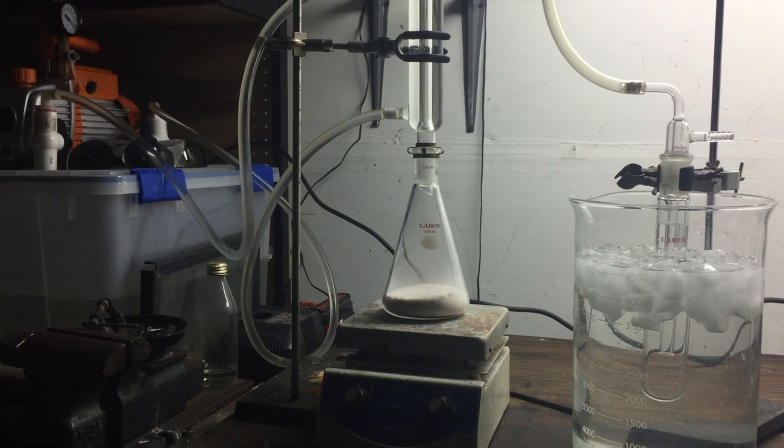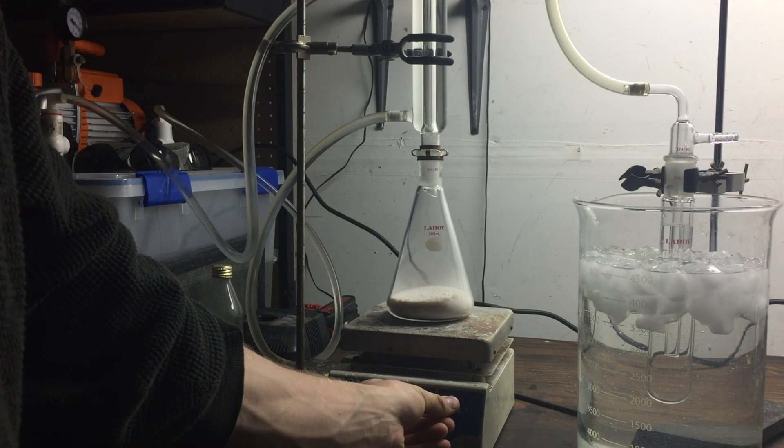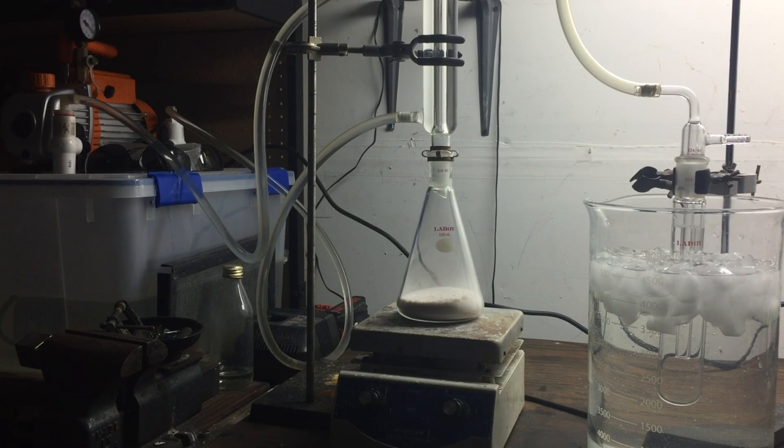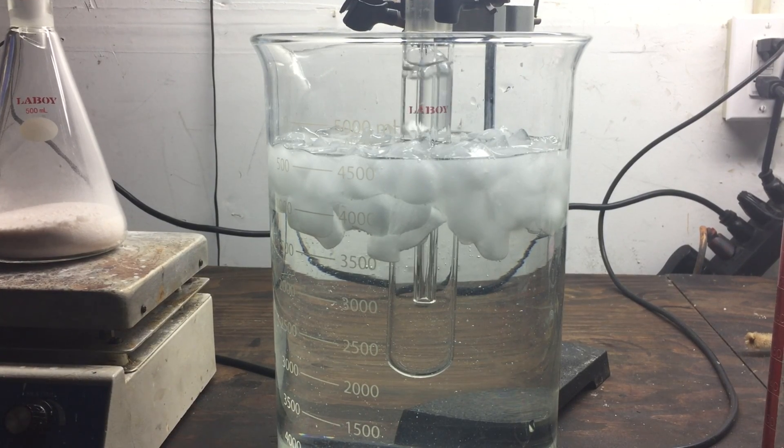I added about 80 milliliters of water to the gas washing bottle on the right, and I turned the hot plate on low. By monitoring the temperature, I maintained a nearly constant rate of bubbling.